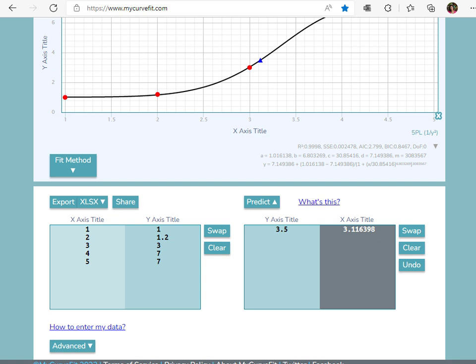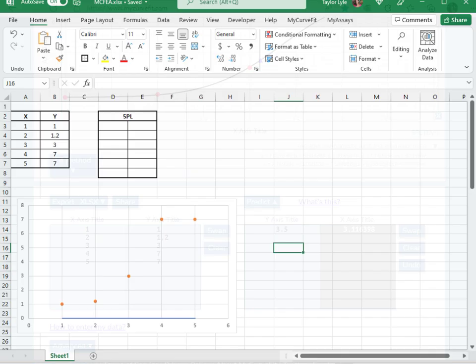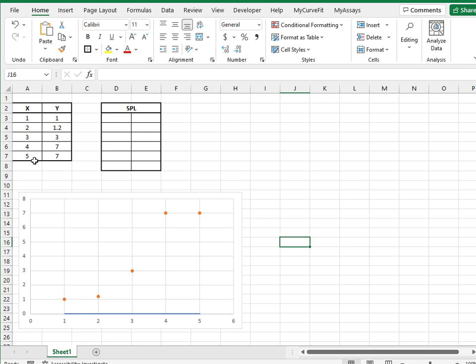To use the MyCurveFit XL add-in, open Excel and enter your data point X and Y values. Highlight the appropriate number of cells, at minimum the number of parameters in your fit method. So, for example, when calculating 5PL fit parameters, highlight at least 5 cells, 6 to include the R-squared value, and an additional column to include the coefficient names.